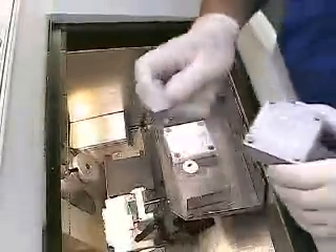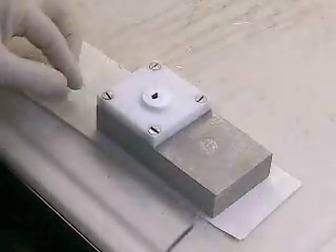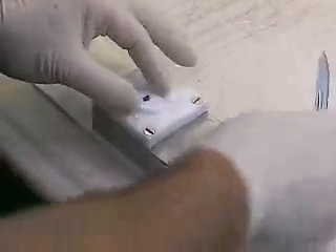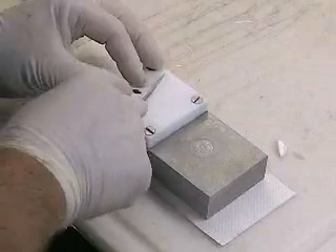I can pull that off with my fingers or a simple little spatula tool. Pulling it off is not difficult. Now we can take this small piece of tissue and cut it in any orientation we'd like. First, what we have to do is just trim off a little bit of the excess embedding medium and square it off.